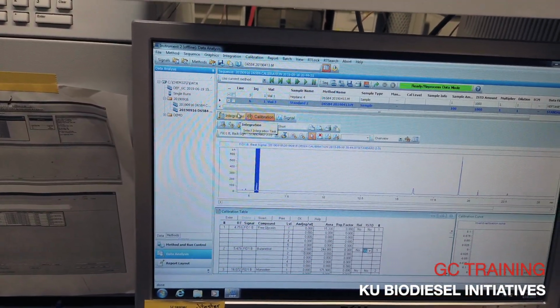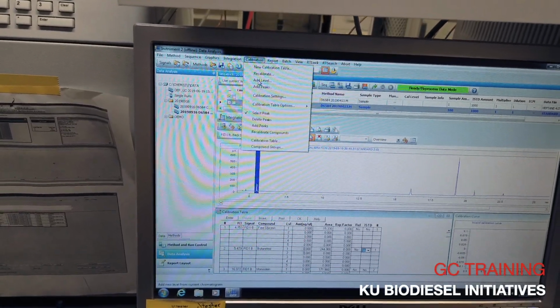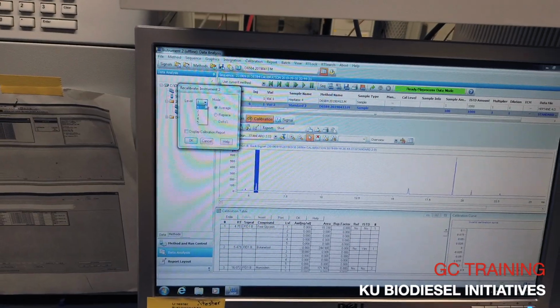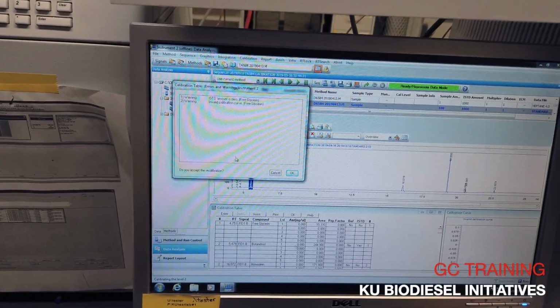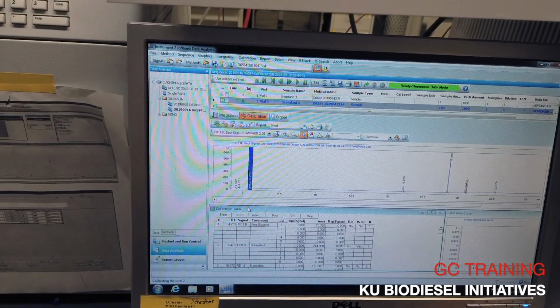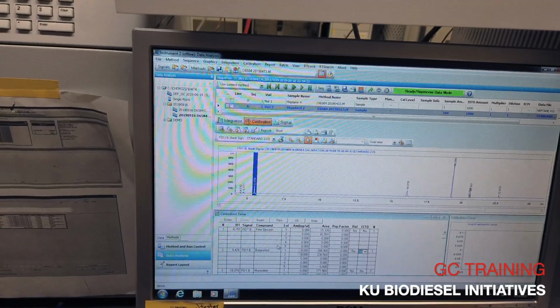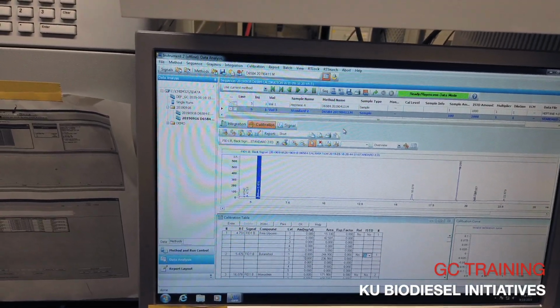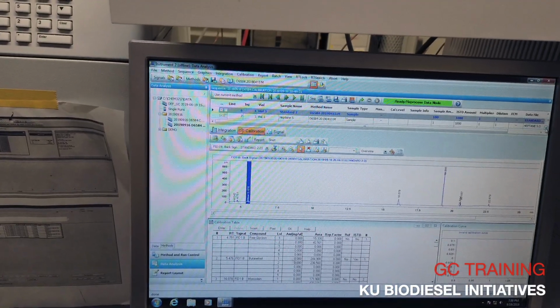It's doing that thing again. Okay, I'm just gonna try it. Level 2, replace. Yeah, I don't know why the software is freaking out. So we're just gonna try it.